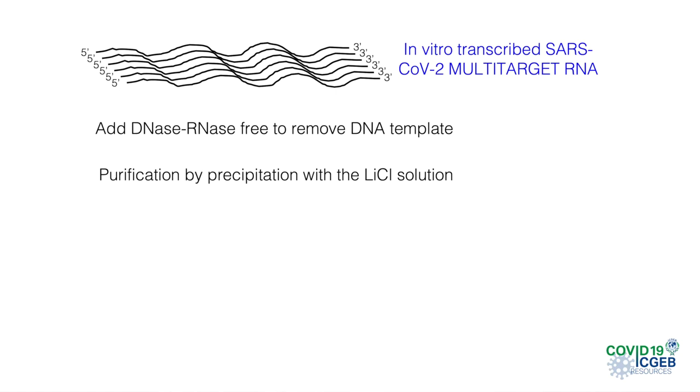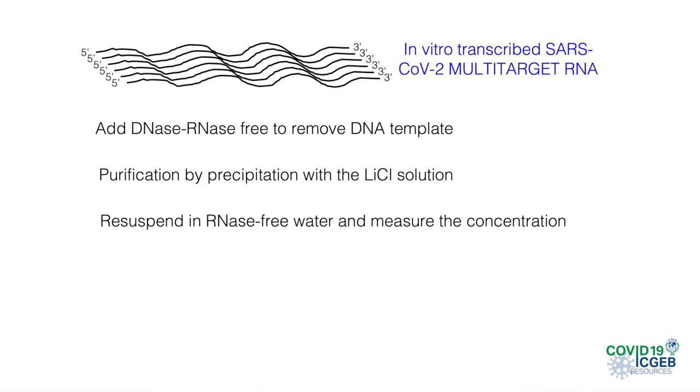The final step is to purify the transcribed RNA by lithium chloride precipitation. To do that, we add 30 microliters of the lithium chloride solution, having previously adjusted the volume with nuclease-free water, mix well, and chill at minus 20 degrees for 60 minutes. We pellet the RNA by centrifugation at 4 degrees for about 15 minutes at 11,000 g, remove the supernatant, wash the pellet with 70% ethanol, centrifuge again to remove the supernatant, and resuspend the RNA pellet in 50 microliters of nuclease-free water.